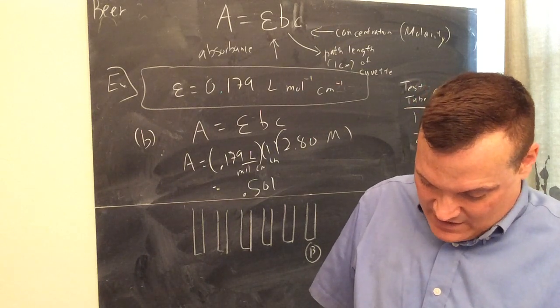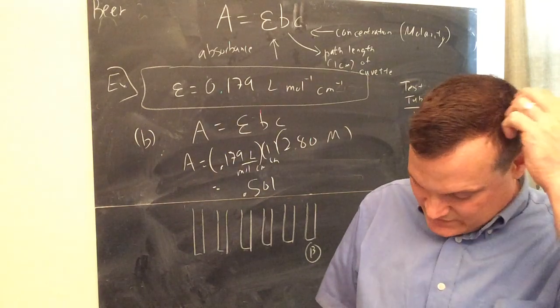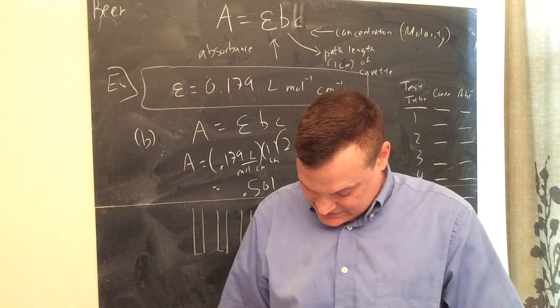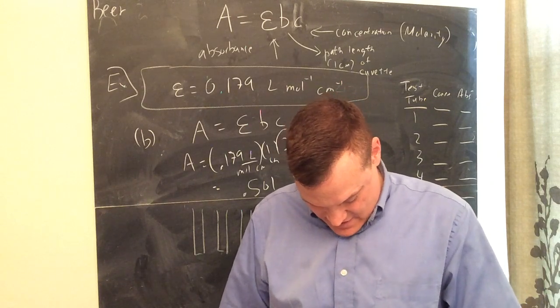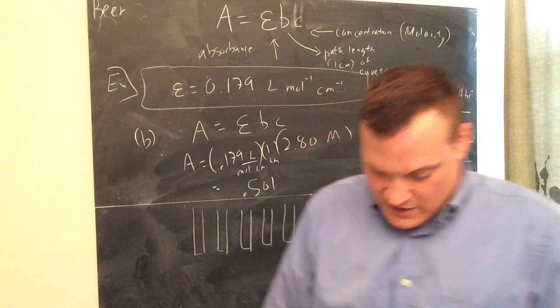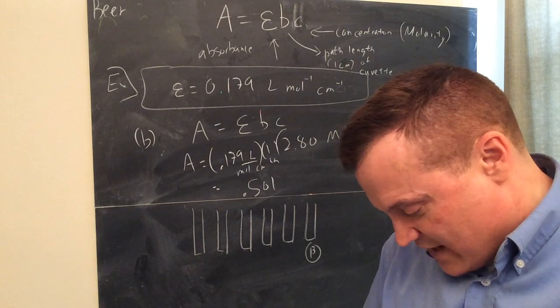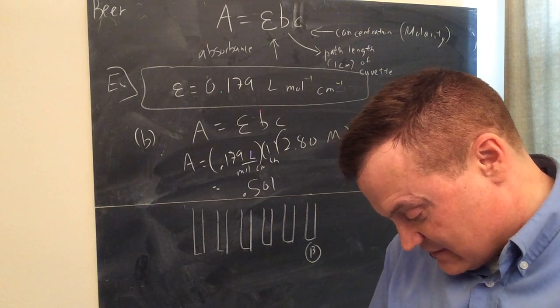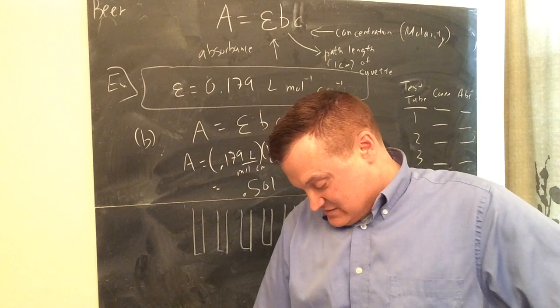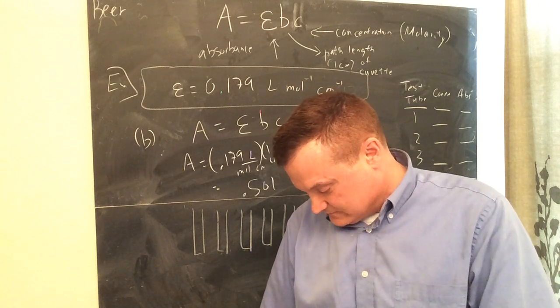Okay. Then on the calculation, you can do number 1. Yeah, you better just use the data for number 1, number 2. Calculate concentration. Okay. All right. Calculate the molarity in each test tube. I need to kind of help you with that one on number 3. How can we do this? Okay. Under the procedure, number 2, 3, and 4 are not going to affect you. You don't have to worry about the molarity on those. You're just adding stuff. You're not changing. Well, we're going to find the molarity. Yeah, you're going to end up having 6 milliliters total.